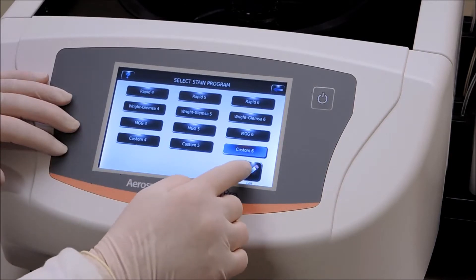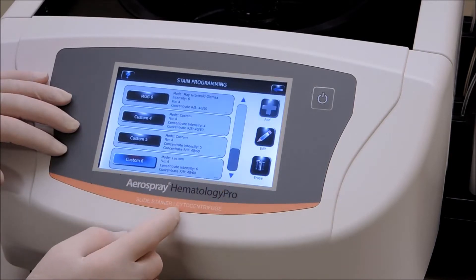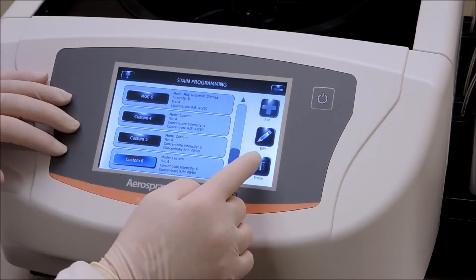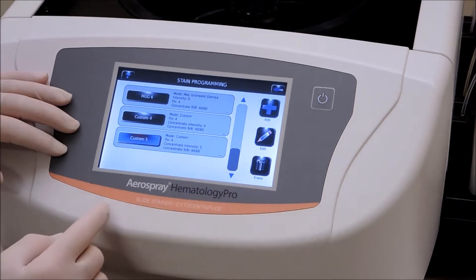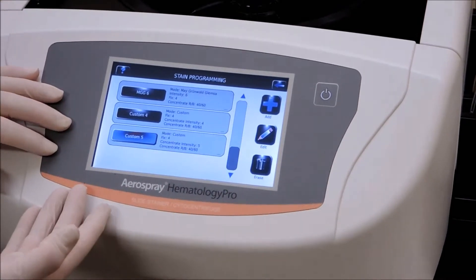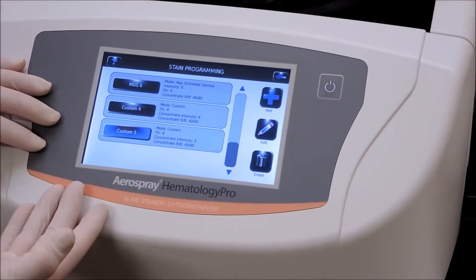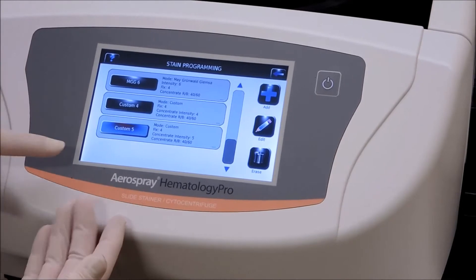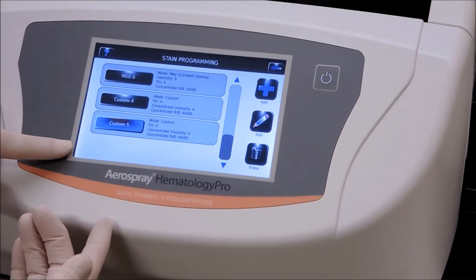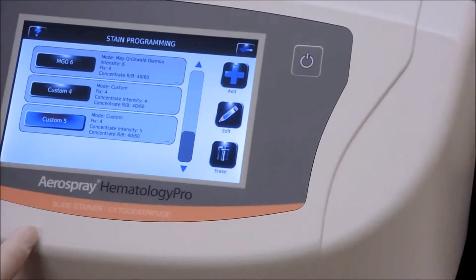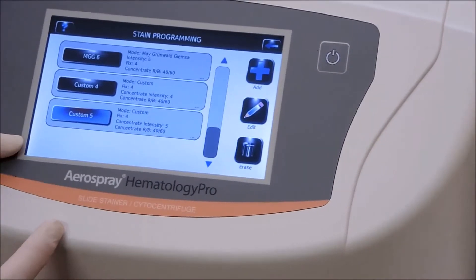We'll highlight six, which comes back to the program. Push the program key — we're going to edit custom six. We will erase that so we have a program slot that we can use.